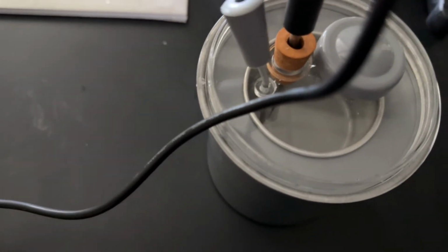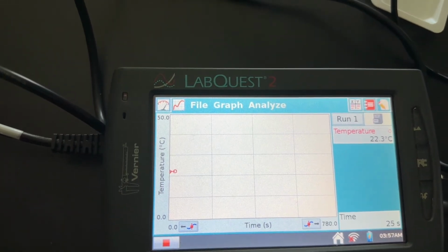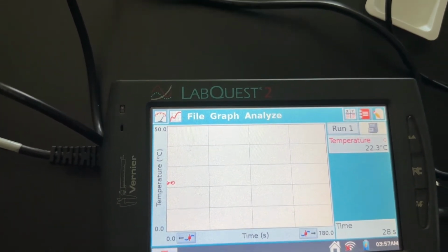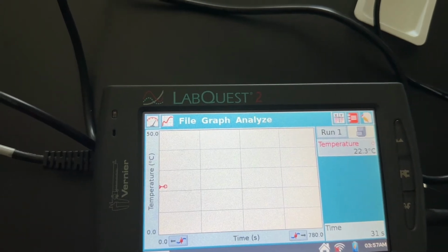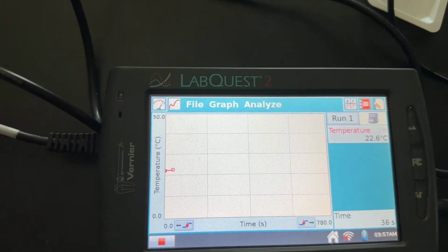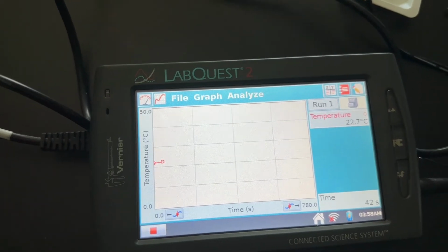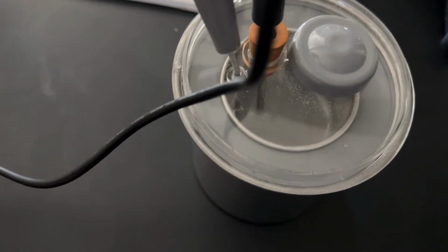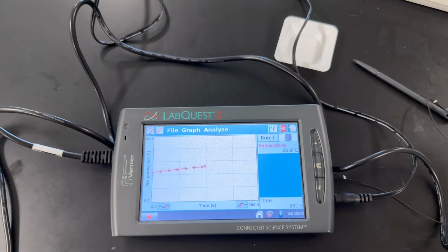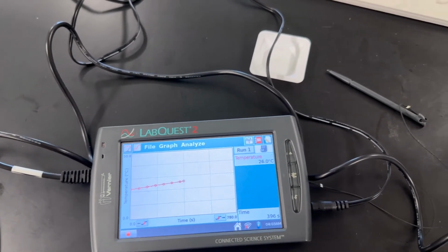And again, this time you know your Cc in that equation on page 2. And so now you are calculating for enthalpy of reaction. And now you're dealing with a solid here, and your liquid, again, that's 1 molarity HCl, 50 milliliters. So it's going to take a little bit longer. And it will require a little bit more swirling as well as some of that reaction takes place. We'll need to continuously expose that magnesium to fresh hydrochloric acid.